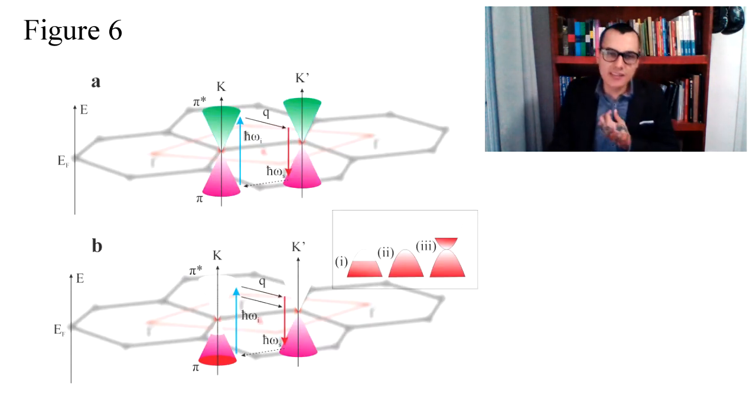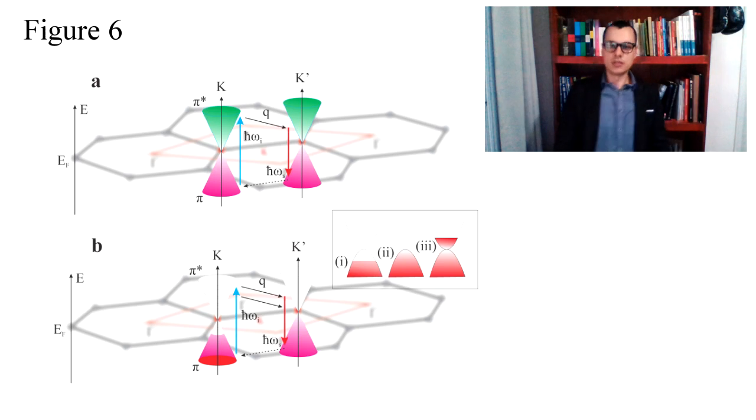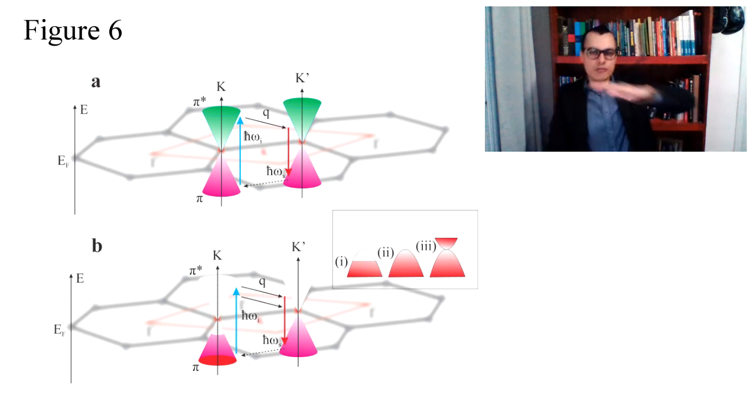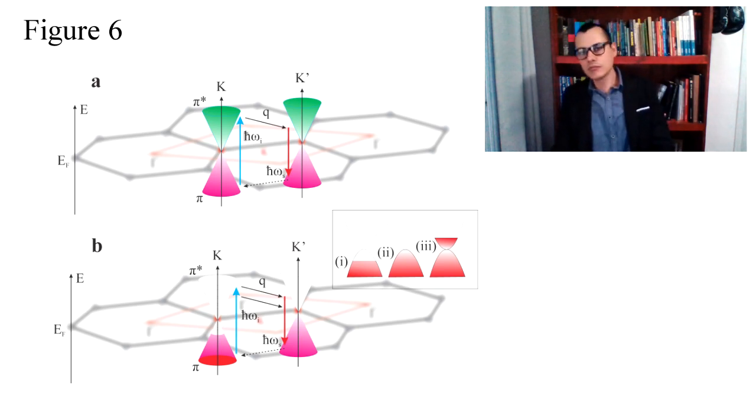Okay, to the best of my knowledge, in the case presented here, the incident photon energy is constant, but the phonon vibration energy, or the wave vector k, is not. By applying a potential to the operando Raman cell, we attract cations to the graphite surface. These cations are electrostatically adsorbed by the graphite layer, forming the electric double layer.